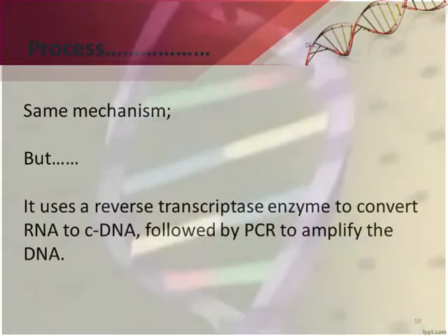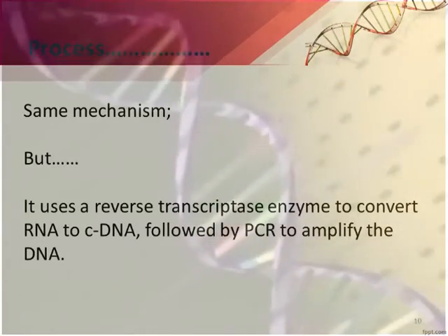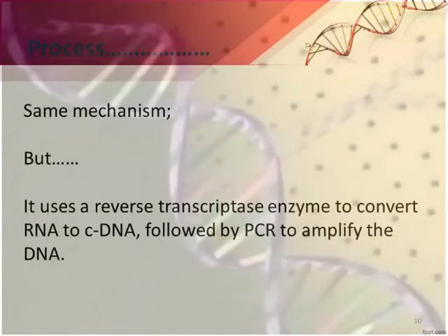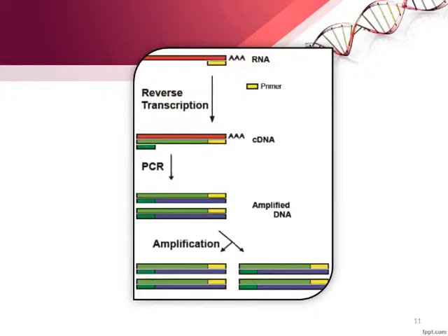The RT-PCR technique is the same as the PCR technique, but it uses a reverse transcriptase enzyme to convert RNA to copy DNA, followed by PCR to amplify the DNA. RT-PCR is used to locate and quantify a known sequence of mRNA in a sample.